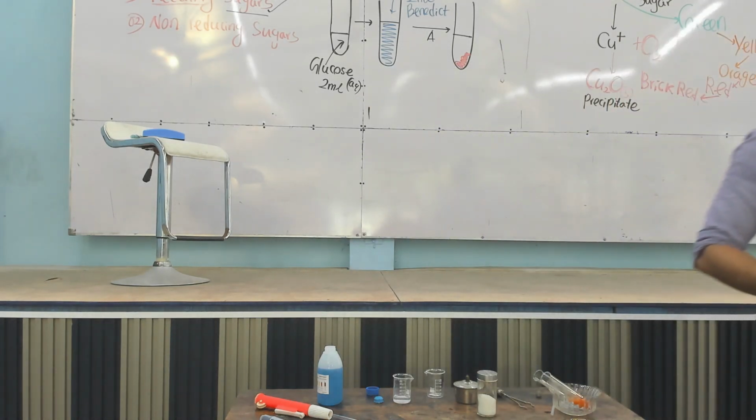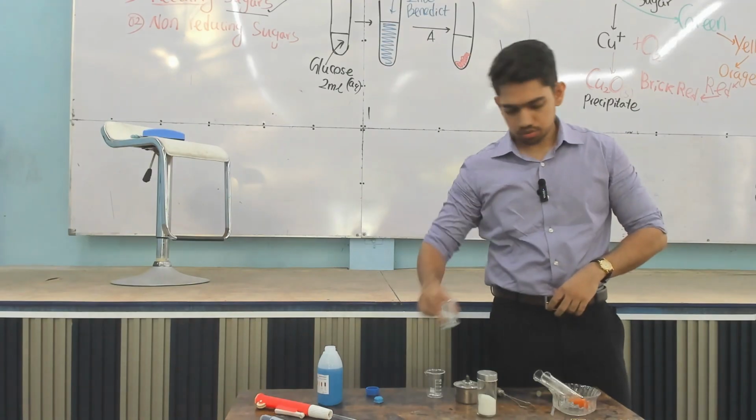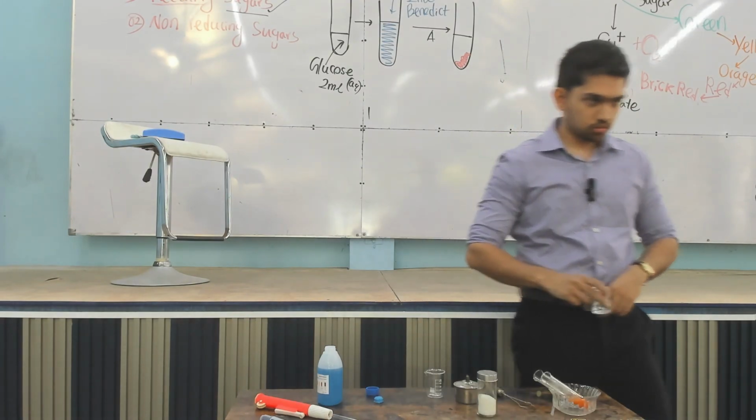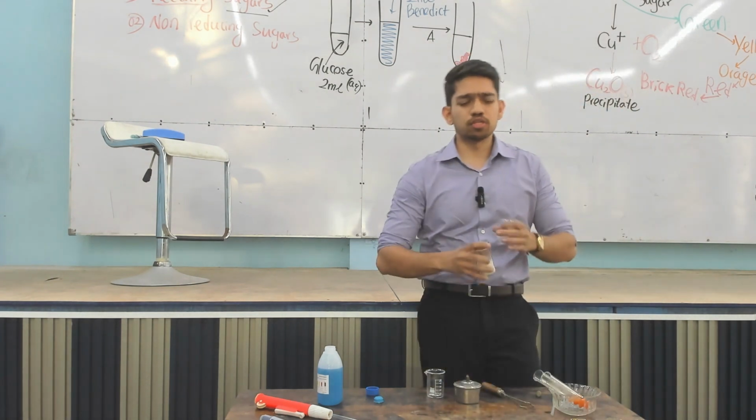So to do that, we are going to need a sucrose solution. To make the sucrose solution, exactly the same procedure as earlier.